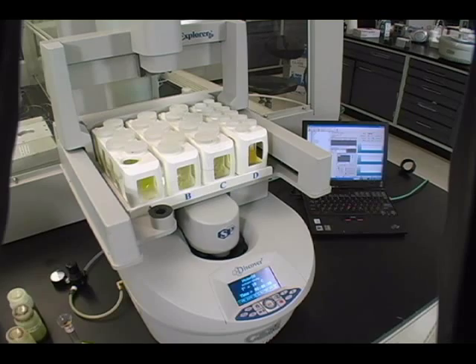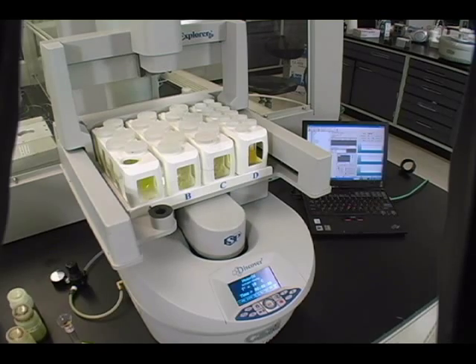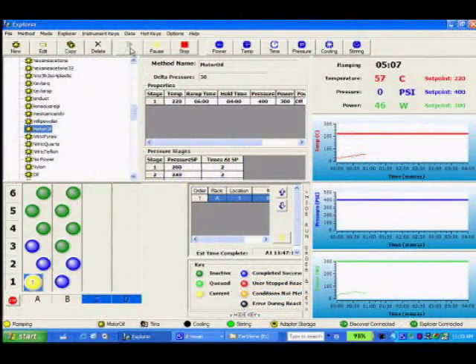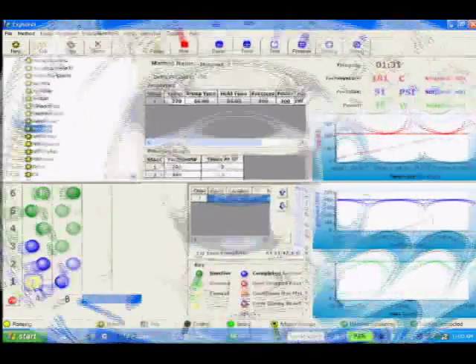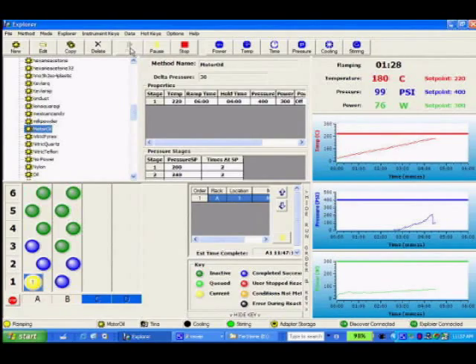The Activent module clamps down on the vial as the PowerMax feature is initiated and digestion begins. The digestion is ramped to 200 degrees or more in 3 minutes or less under full pressure and temperature control.